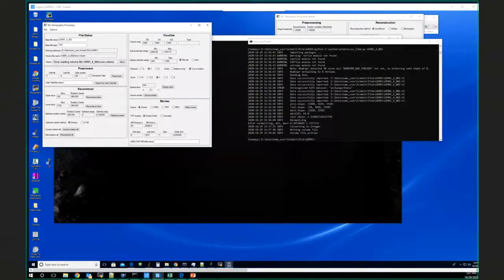There are a lot of people that work on pores, using tomography to quantify porosity and segment the CT images so you know where the pores are and where the grains are. A lot of people then put those into lattice Boltzmann codes to predict permeabilities and so on. So yes, and we've had quite a few users who've done exactly that.